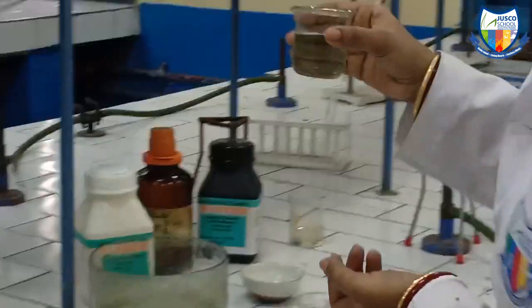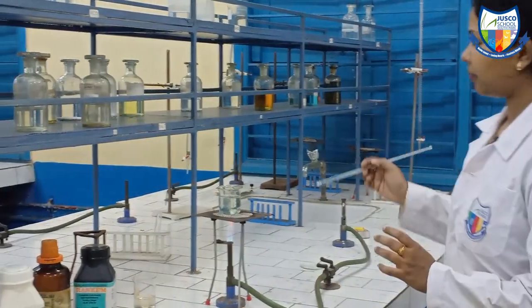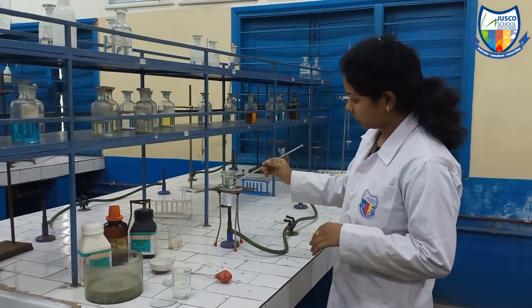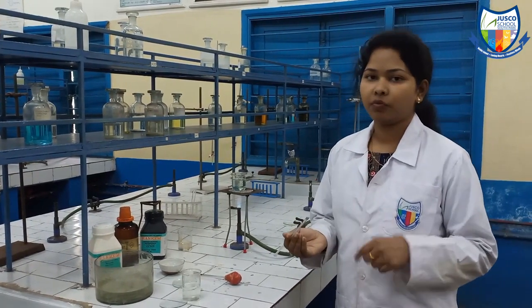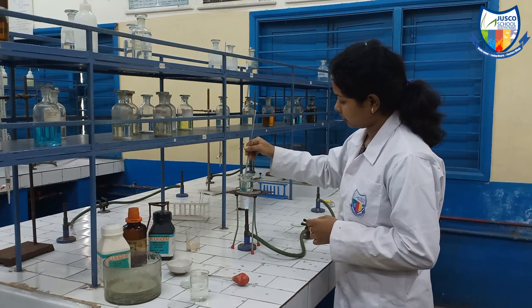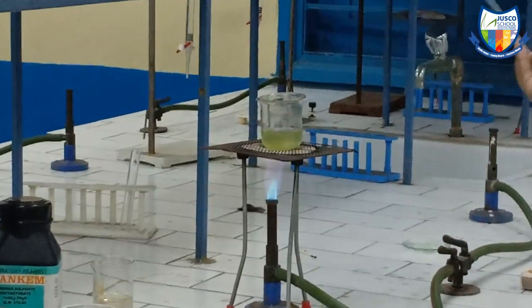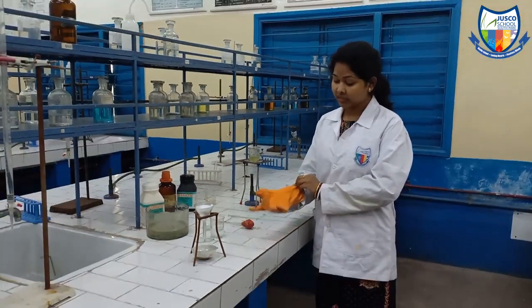Now we have collected the filtrate and we will put it to heat. You can see I have placed it on the burner. The solution is currently around 30 to 40 ml. When it reduces to at least 20 ml, we will start filtering it again and you will see the crystals. In the middle we will stir a little. As you can see the solution has come to a concentrated quantity — now remove the burner and let it cool for some time, then we will filter it.